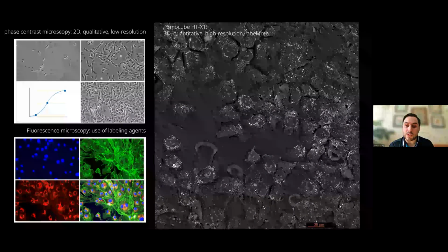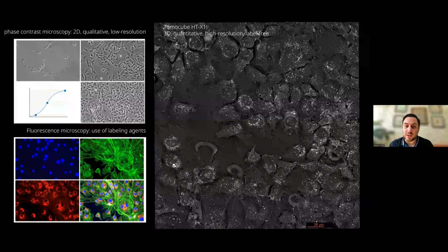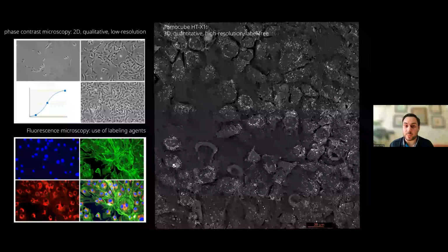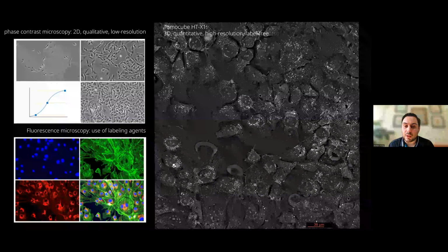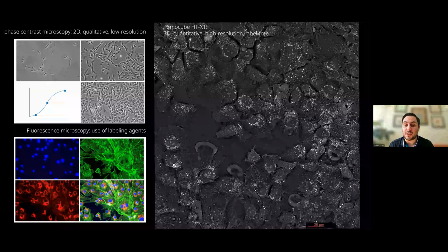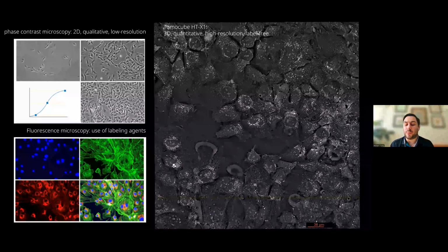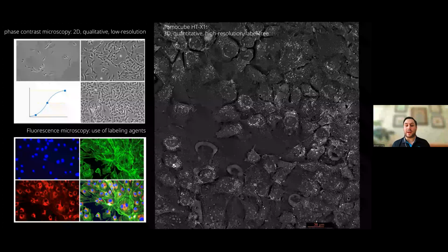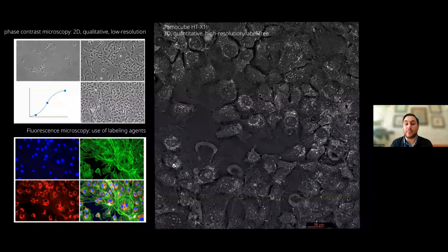The next question is, we are implementing our own analysis at Tomocube, but can the user implement deep learning custom macros to analyze the images? What is the format of acquired images? Some of this we can definitely follow up with offline. But Paul, would you mind talking a little bit to how we might work with customers to help them implement their own deep learning?